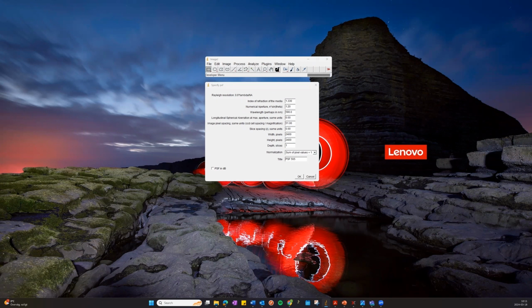And it's important to note that the protocol I'm describing today will only outline the process for 2D deconvolution. Even if 3D Z stacks have been acquired, I recommend that you deconvolve each slice of the Z stack individually, and I'll talk more about why this is important later.